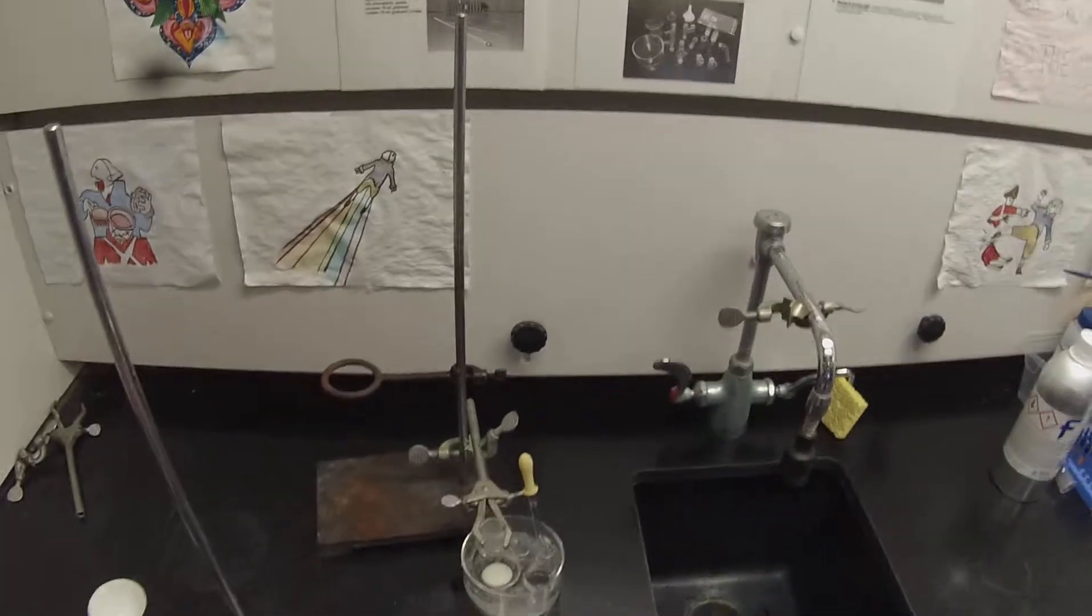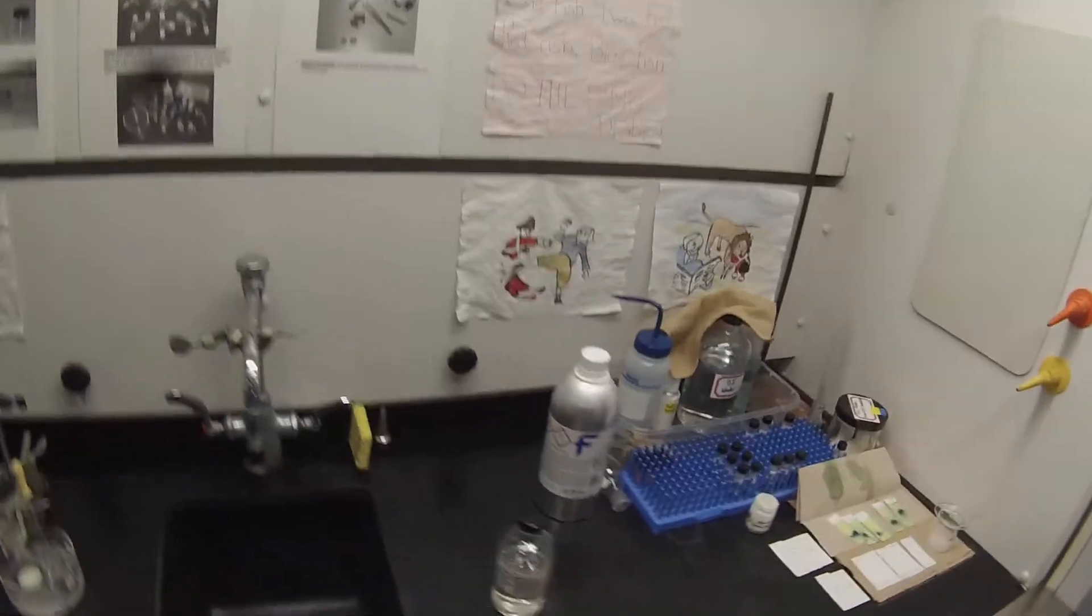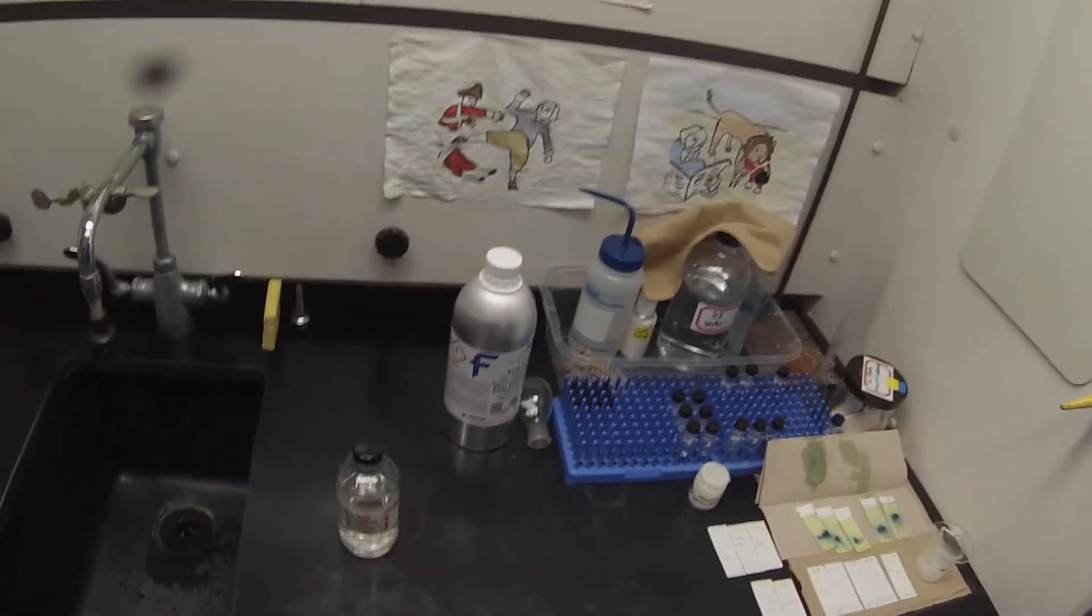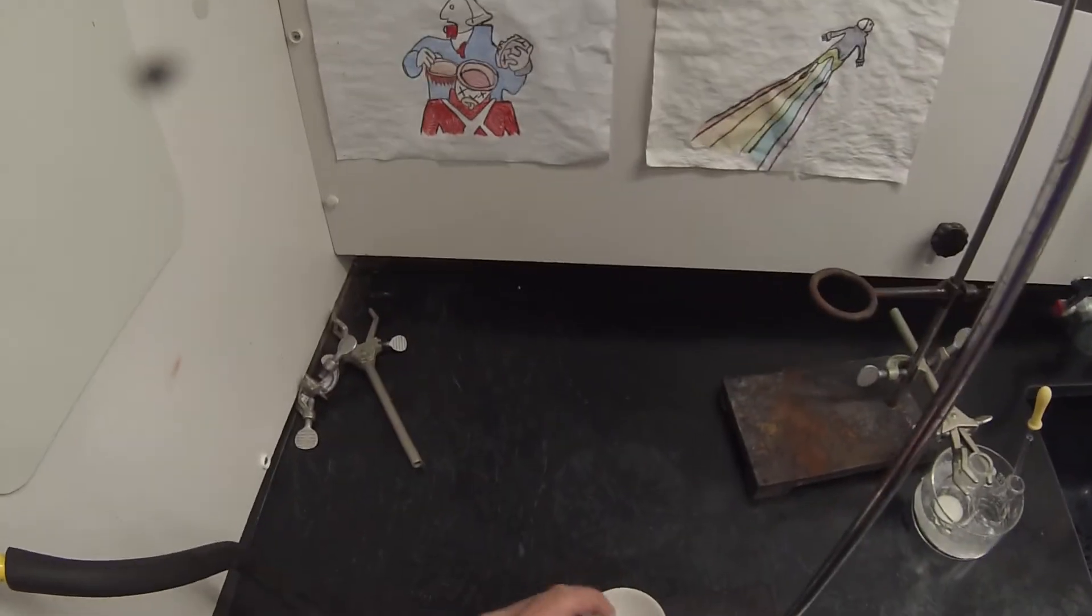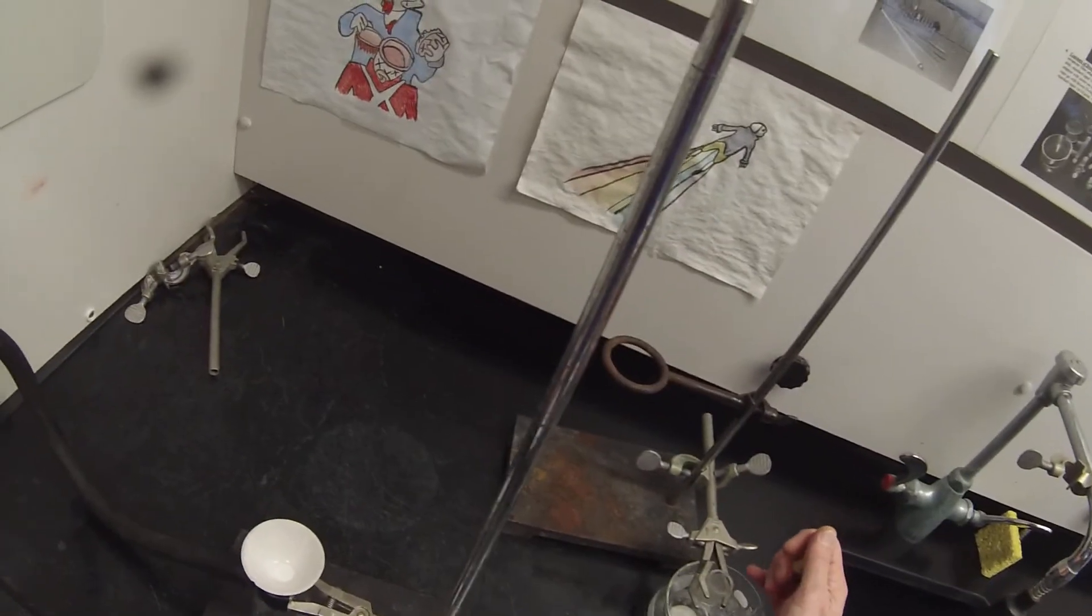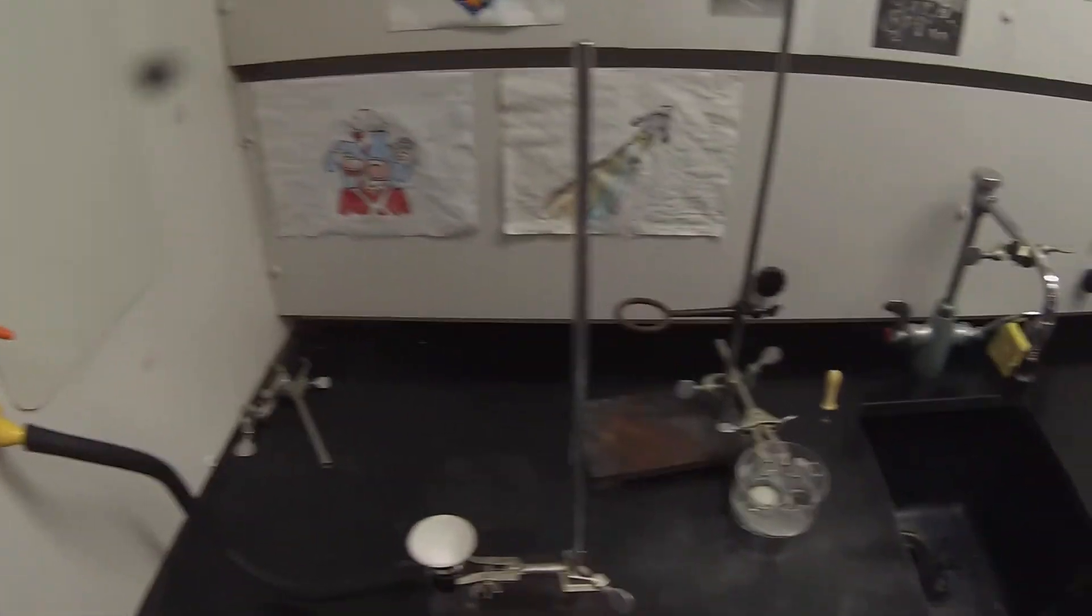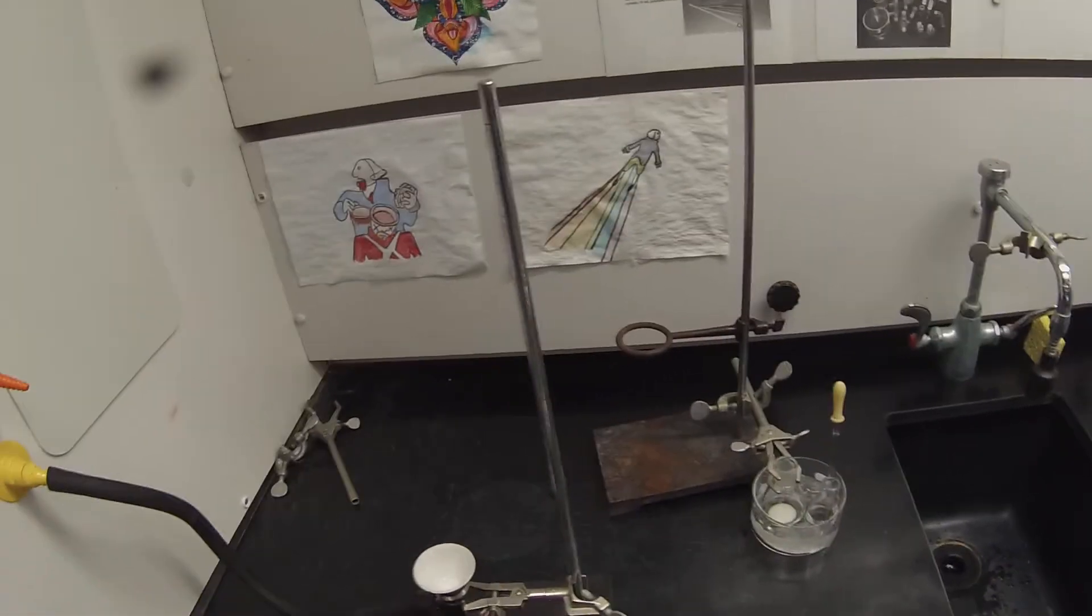We'll just let that cool, it won't take very long. Let the ethyl acetate evaporate. Since the NMR is down right now, we won't actually be collecting NMR data for a while, so we'll just let this stuff dry so we can calculate a yield. While we're waiting, I'm going to get a 10 milliliter beaker with a label on it.